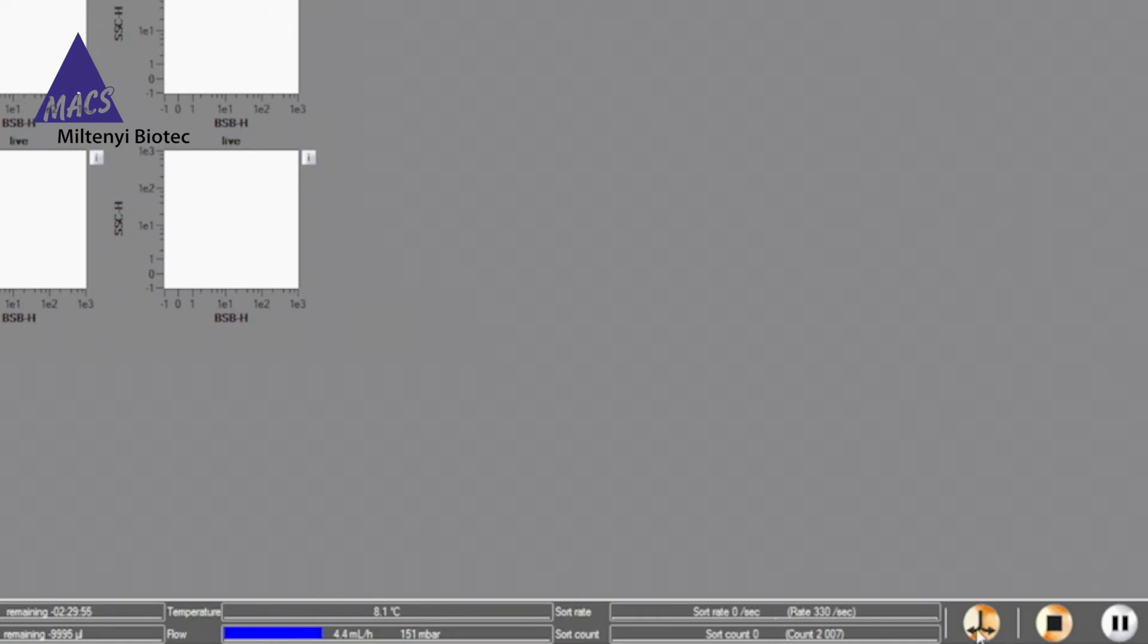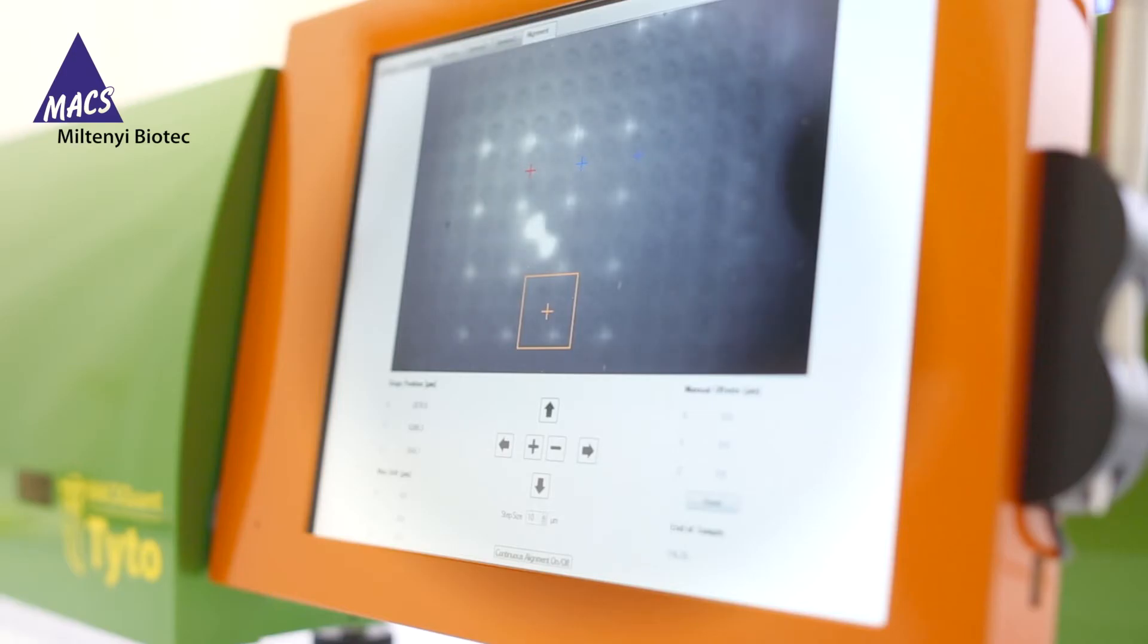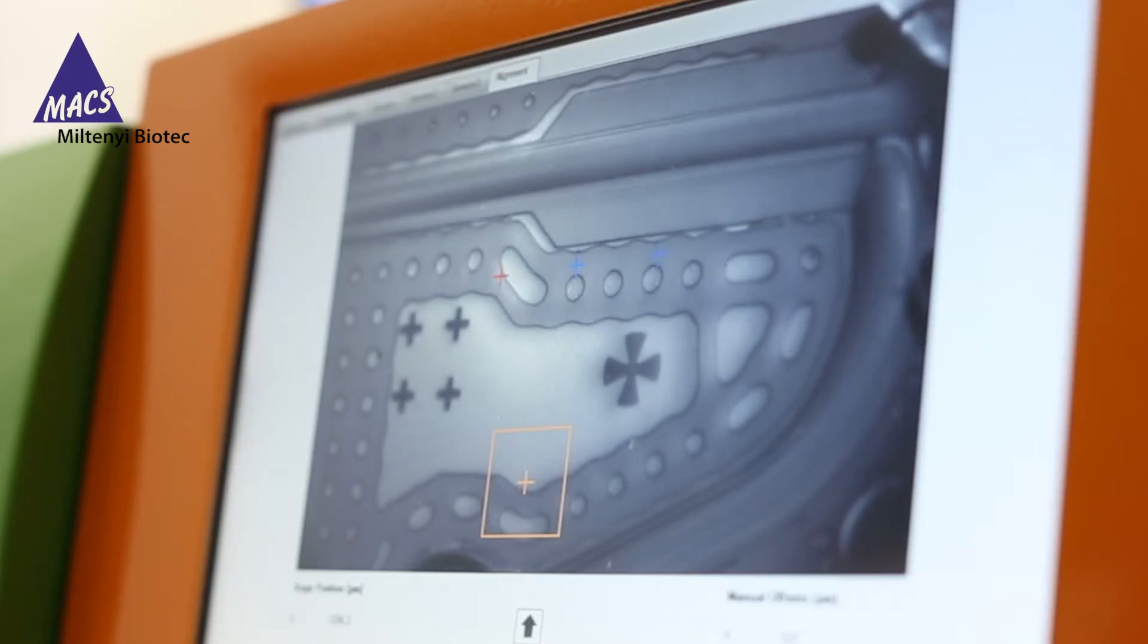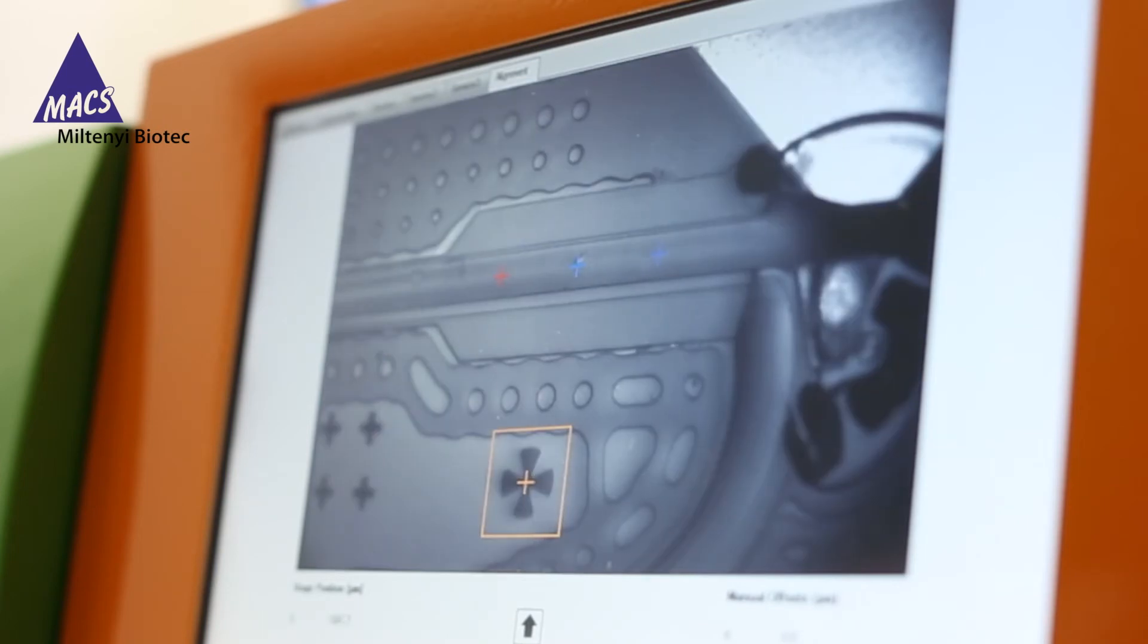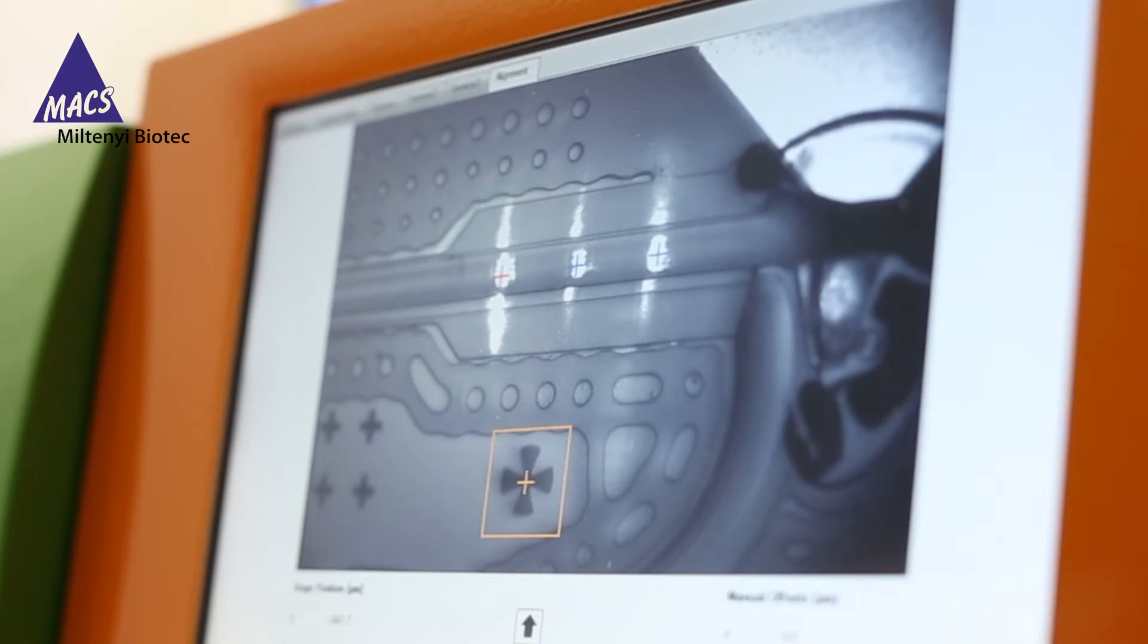After pressing the sort button, the instrument automatically initiates the laser alignment routine. Image recognition finds the precise laser interrogation position and the sort begins.